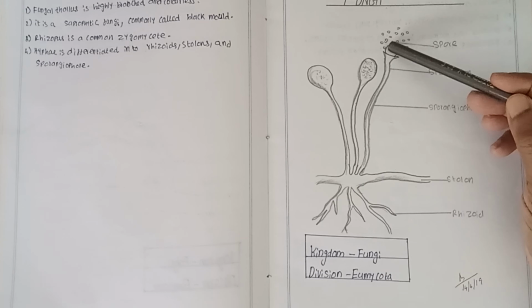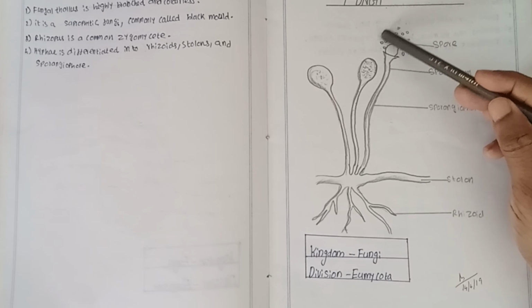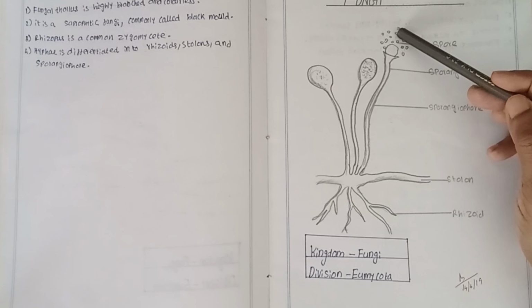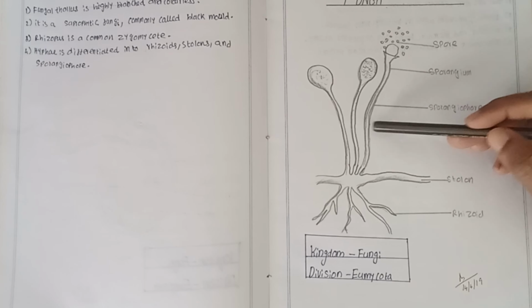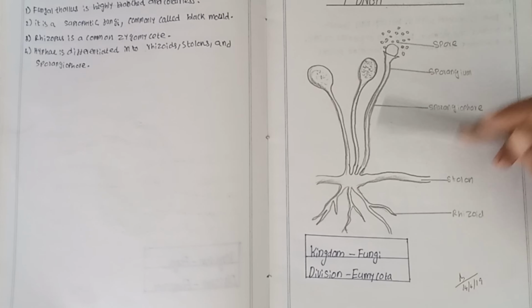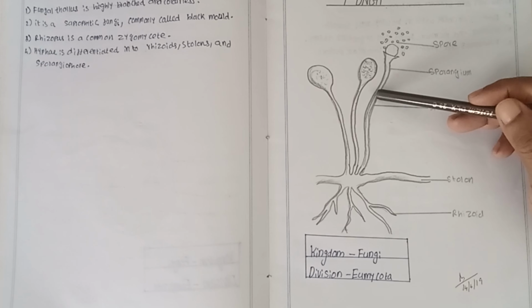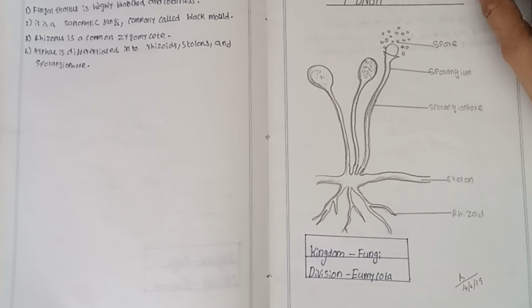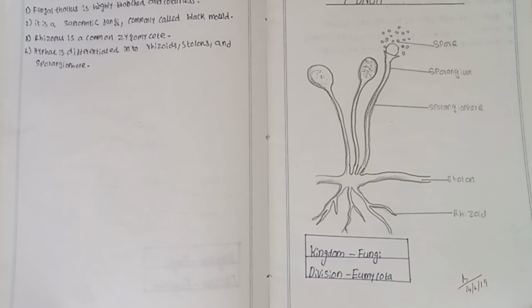This is the columella part. These are the spores. This is the ruptured sporangium with the columella and matured spores. They usually develop on bread, chapati and similar food substances. They also split glucose and use the energy as ATP molecules for their development.